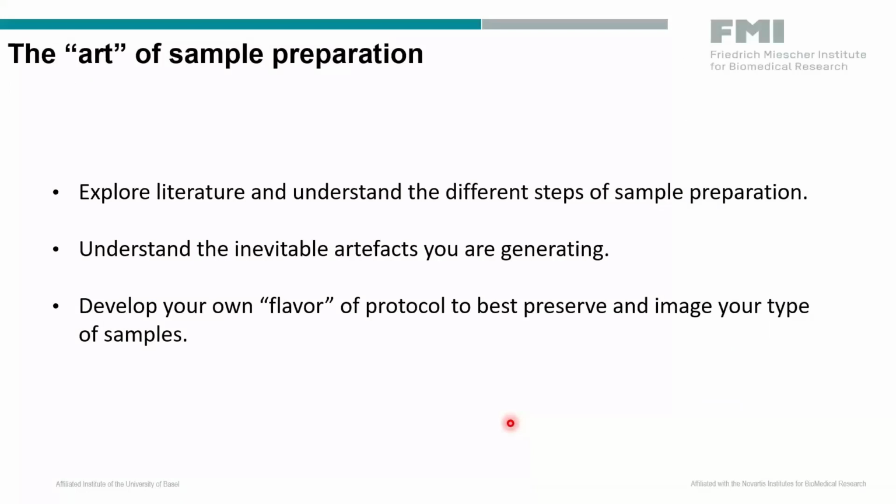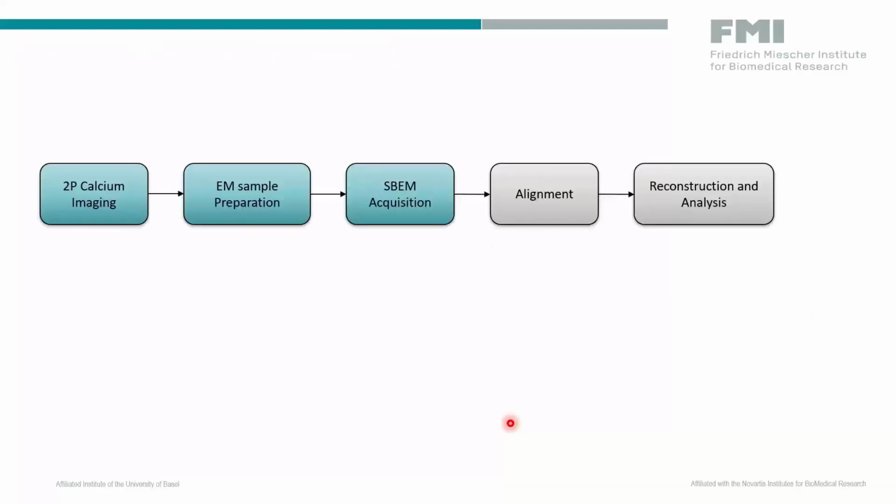So, the art of sample preparation. We don't have the magic solution or the magic protocol. I mean, you have to explore the literature and understand the different steps of the sample preparation before you go with your own sample. You also have to understand the inevitable artifacts you are generating. And you may develop your own flavor of protocol to best preserve the sample and for imaging your type of samples. I think that's the take-home message regarding the sample prep.